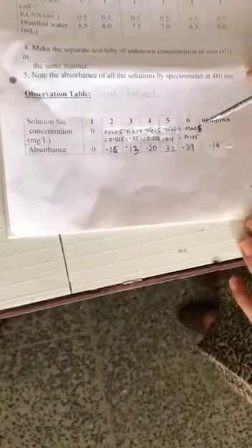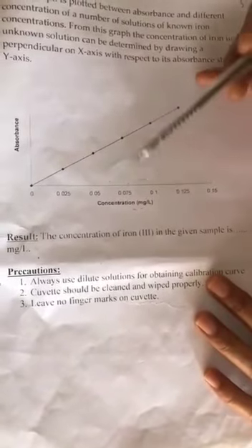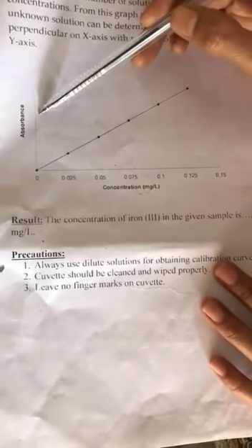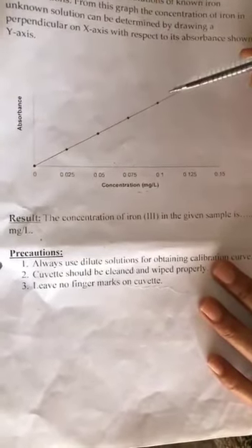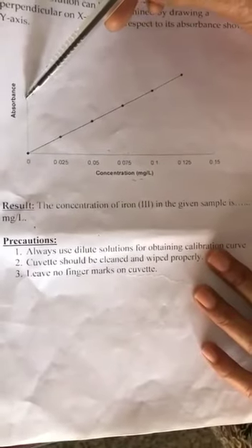As you have seen, as the concentration increases, the absorbance value increases. Now we have to plot the graph between the absorbance and concentration. We put the value of absorbance on the y-axis and concentration on the x-axis. All the points lie on the same line and from the origin. The graph between absorbance and concentration is known as the calibration graph.